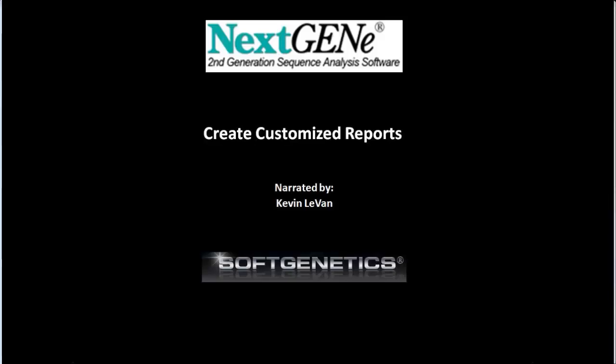Hi, my name is Kevin Levan, and today I'm going to be discussing the summary report of the NextGene viewer.